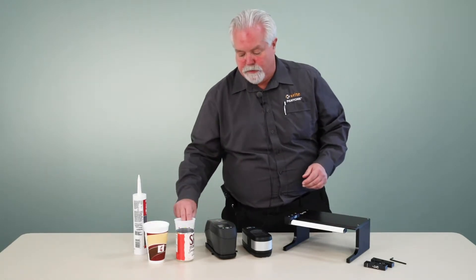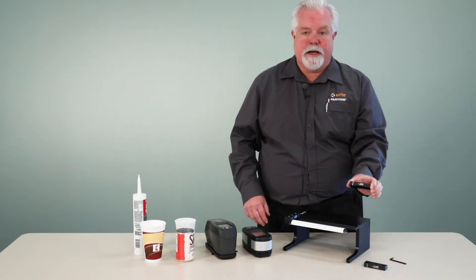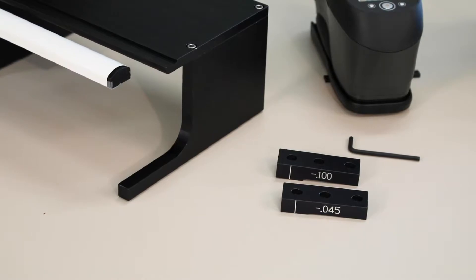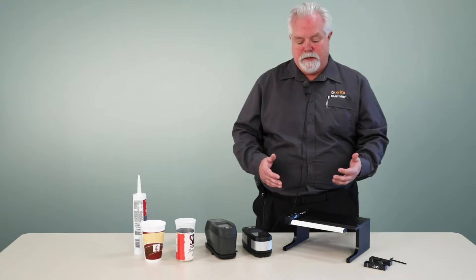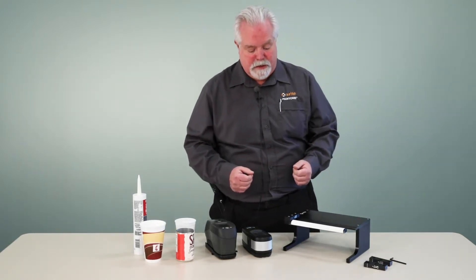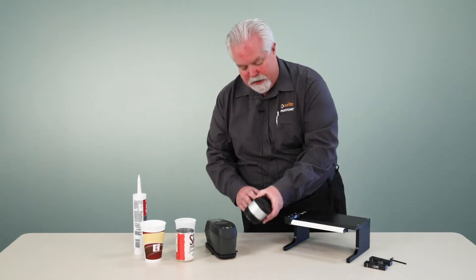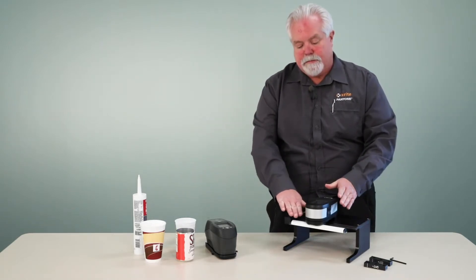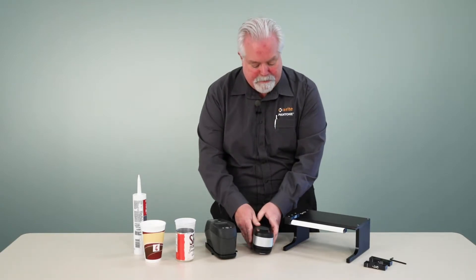In other words, if we switch from a plastic cup to a foam cup, we can switch to a different height adjustment block that has a greater offset. Typically, I would expect most customers are going to purchase one height adjustment and use that all the time, but you do have the ability to switch if you need to. There's a platform that the instrument sets on, so when we're taking a measurement, the instrument sets on here and that places it at the same plane as the top of our sample.